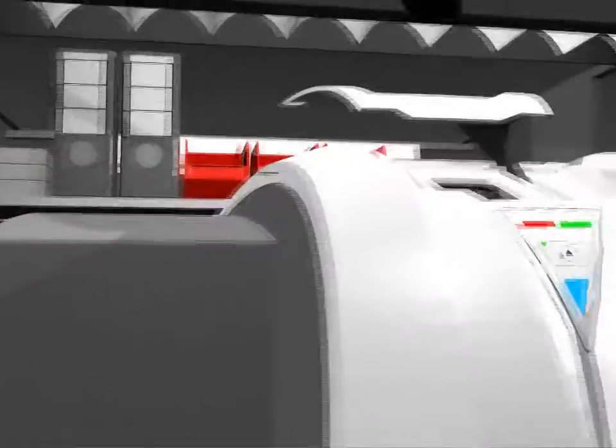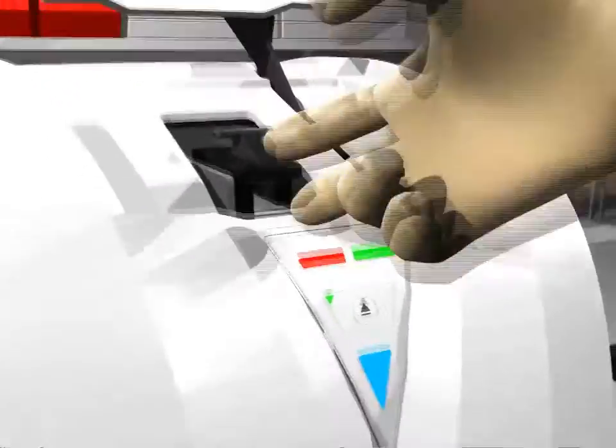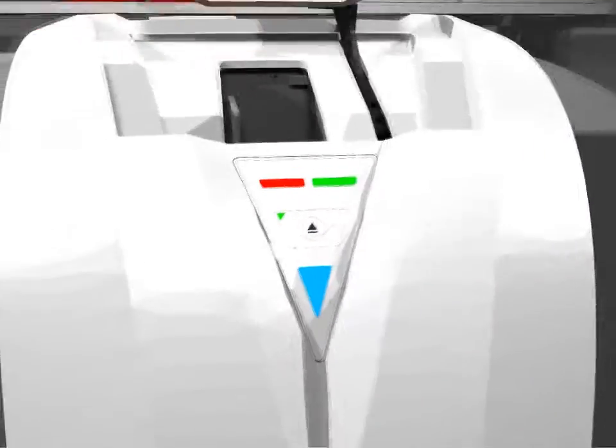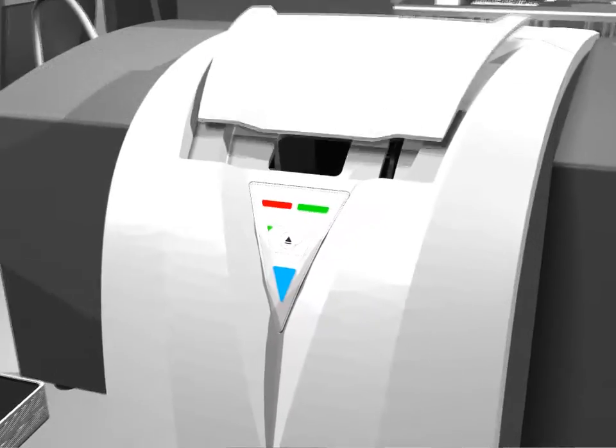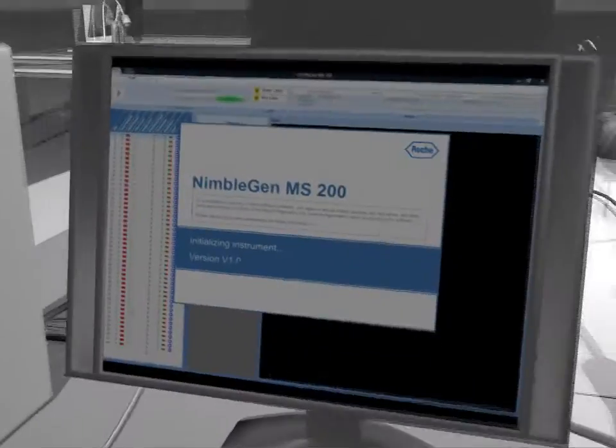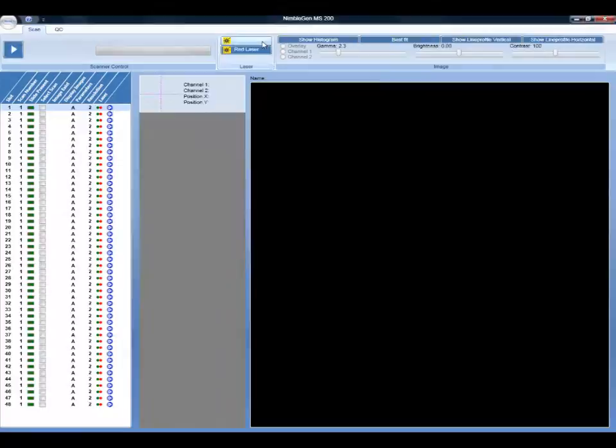Regardless of the number of experiments, the quick and easy loading of the handy slide carrier maximizes safety and saves time in your daily routine.